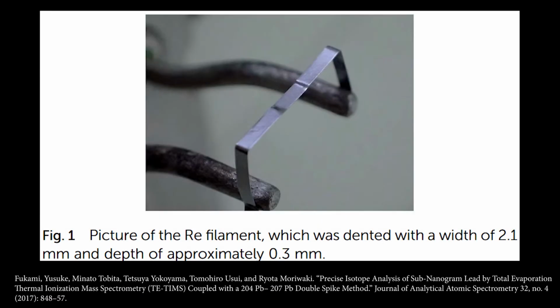Another alternative method that's going to be pretty popular for ionization when you're trying to look at isotope ratios. So like I said, you can use ICP, but another possibility is a pretty old method called thermal ionization. A lot of times they'll call it thermal ionization mass spectrometry, or TIMS.